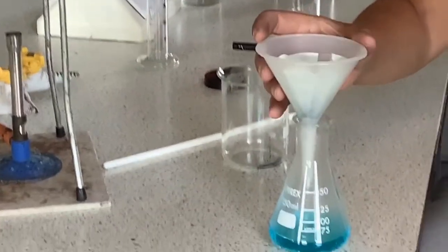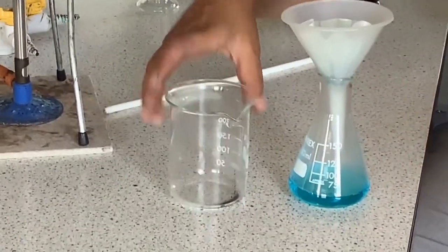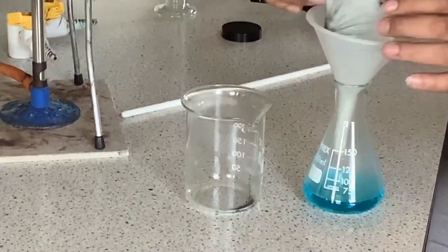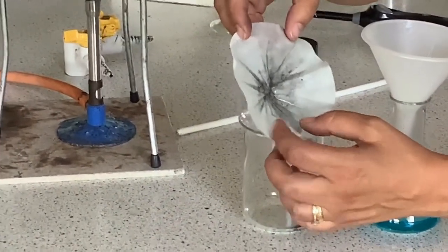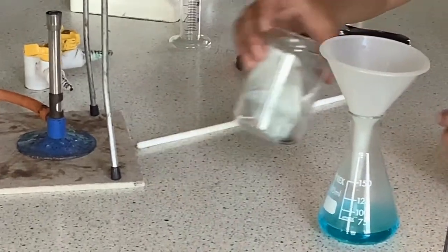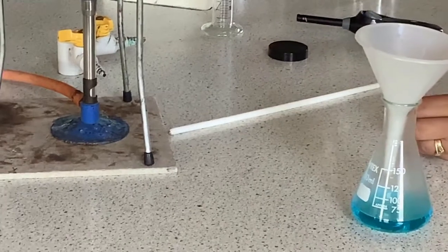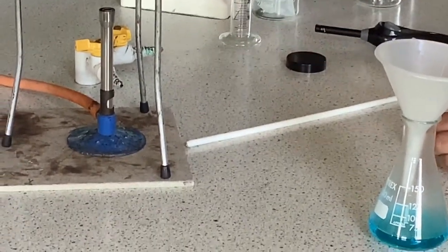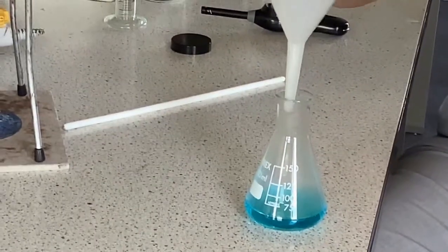And we see now that we have our blue copper sulfate solution, something you will have seen before, and on our filter paper we still have the black copper oxide that was in excess. Now in this kind of experiment we always add the solid in excess because it's easy to remove by filtration. If we'd added the liquid in excess, then separating two liquids becomes more complicated.